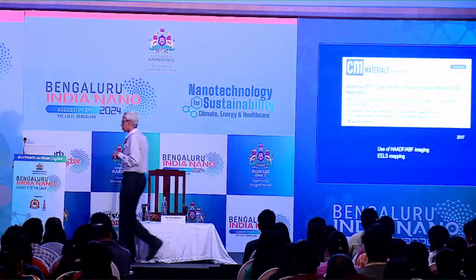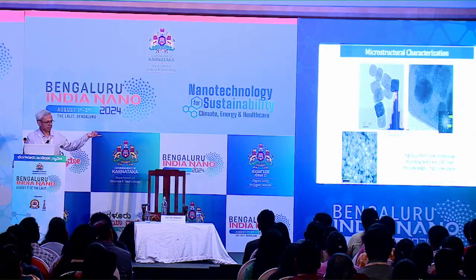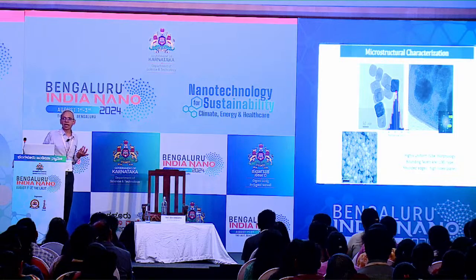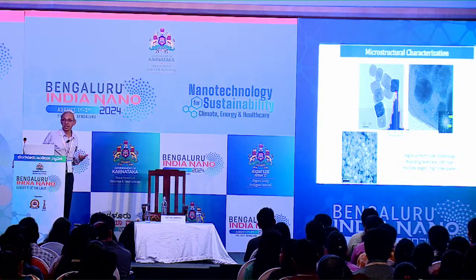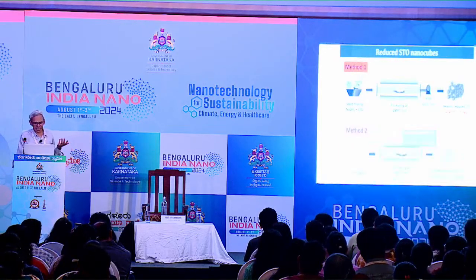We want to map where these titanium ions are, how they are reduced and where they're sitting. For this, again, we use a model system of strontium titanate nanocubes that we make in the lab, and we are heating them in a highly reducing atmosphere. We want to ask the question: how is this titanium reduced, what oxidation state is it present in, and where is it present in the material? The details are there.